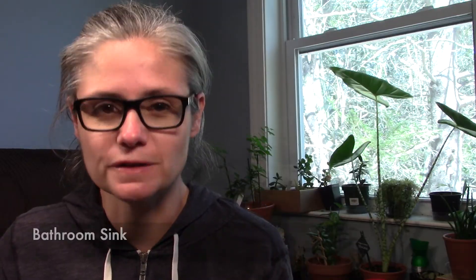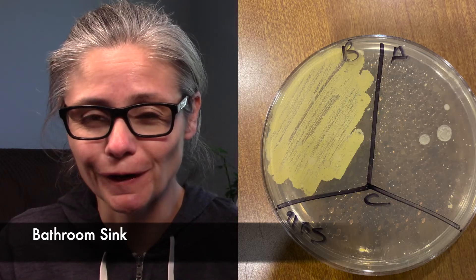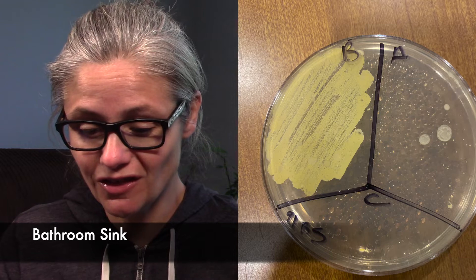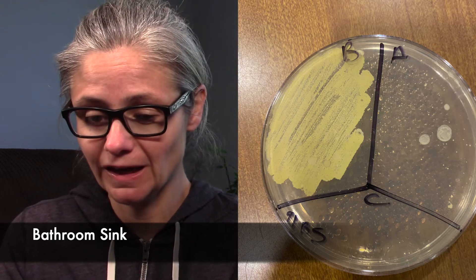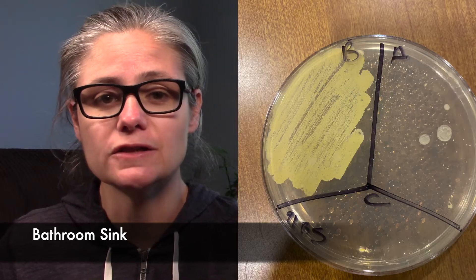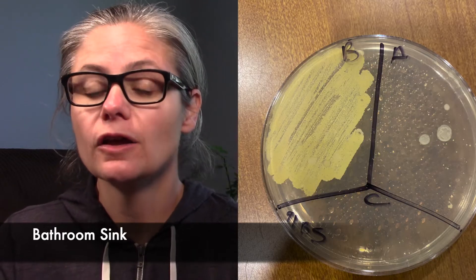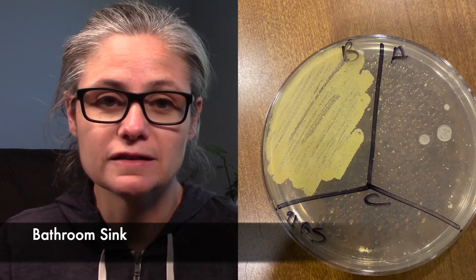The bathroom sink. Look at that before section — that has a lot of bacteria. And let's look at that after section — there's not much there at all. I can count less than half a dozen bacterial colonies growing after disinfecting with the 91%. So in my home, the 91% alcohol does an excellent job at disinfecting my bathroom sink.